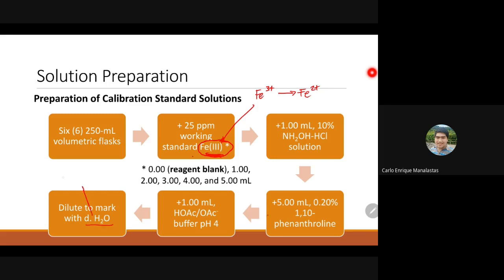In particular, you need to use a special kind of distilled water called distilled deionized water. If it is available in the laboratory, you should use this instead of the usual distilled water for the UV-Vis analysis. Otherwise, the distilled water would do fine as well.